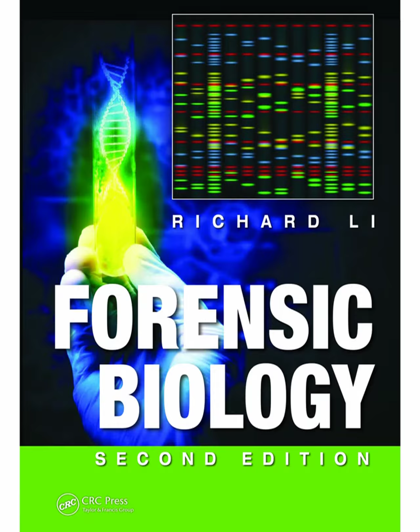And that fragmentation pattern tells you the peptide sequence. Essentially, yes. By analyzing the masses of the fragments, you can deduce the amino acid sequence of the peptide. Then you search that sequence against protein databases. If you find matches to known proteins, like hemoglobin for blood or PSA for semen, you've identified the fluid. That sounds powerful, especially for complex mixtures, maybe. It can be, yes. Bottom-up proteomics is well suited for analyzing the complex mixtures you often find in forensic evidence.